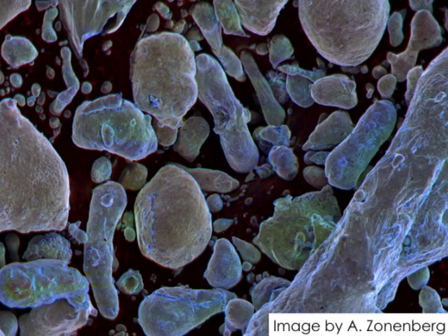And so these secondary electrons are very low energy, and they're emitted from very near the surface of the sample. This makes them highly responsive to the topography of the sample, and also highly responsive to the primary energy of the beam. This image is of a metal powder and is a false color image that's composed of red, green, and blue.